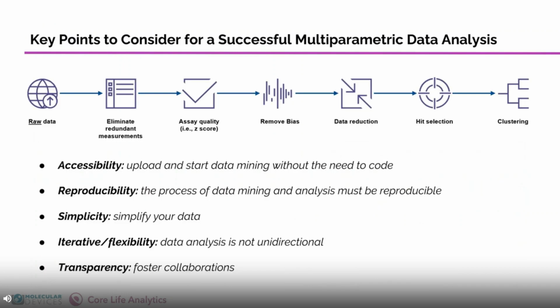So to summarize, when you develop your high-content data analysis workflow, you need to consider these key points here to ensure the robustness of your analysis pipeline. And I cannot emphasize enough that having a robust workflow like we have in StratoMineR that doesn't go all over the place will pay off enormously at the end by keeping your data analysis straight and narrow.